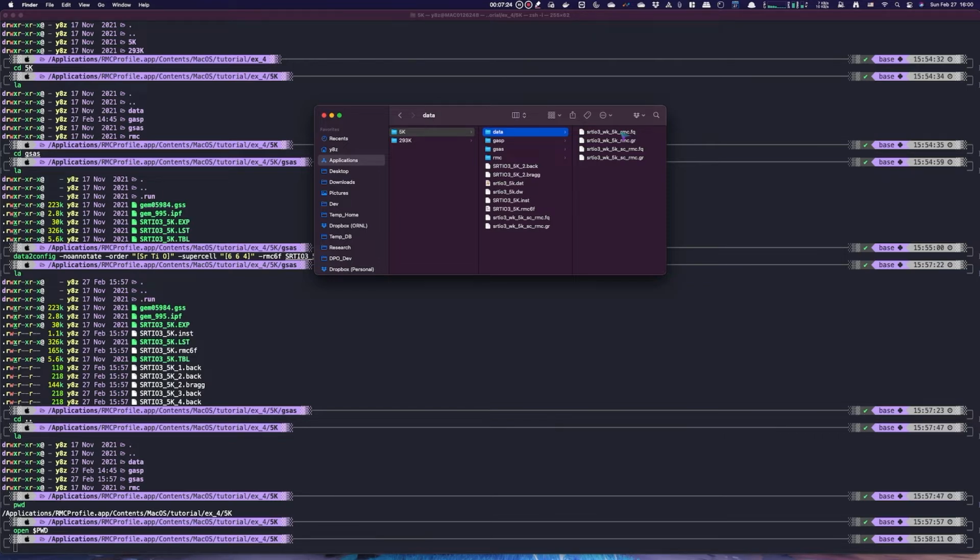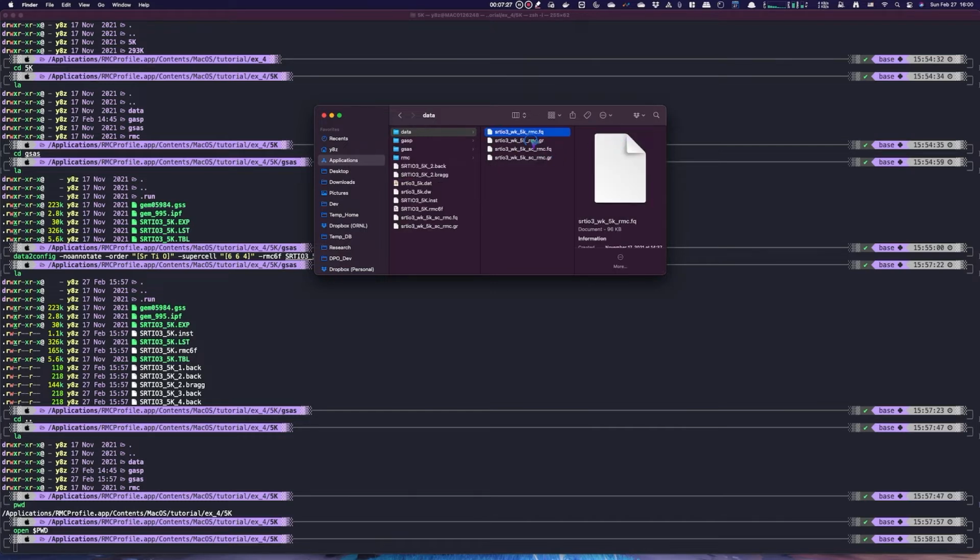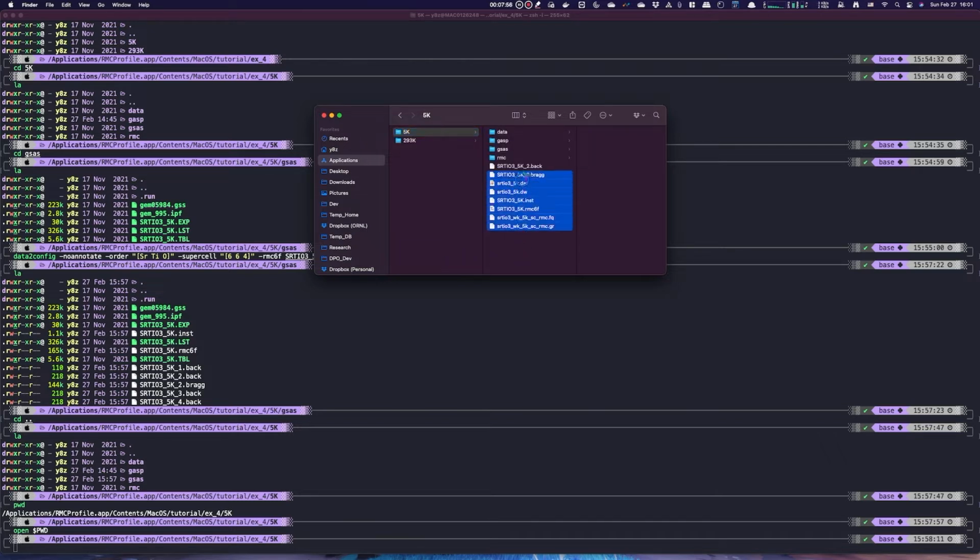an absolute scale. And given these two data sets are not on an absolute scale, we can use the so-called STOG program that comes together with the RMCProfile package to do this rescaling job, to go from this unscaled or improperly scaled data to this properly scaled or absolute scaled data. So those are the two data files we want to copy into this main folder. That's probably all the things we need to do the further RMC fitting.